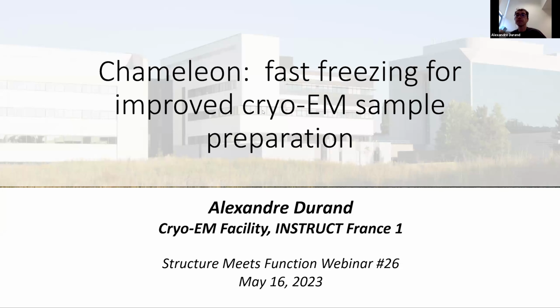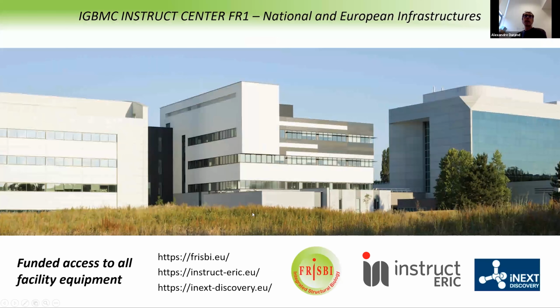Okay, so hello everybody. I will present to you the chameleon, which is available at the cryo-EM facility of Instruct Center France 1. The chameleon is a device to improve sample preparation for cryo-EM. Catherine quickly introduced the Instruct Center France 1. I will not go into the details of it, but all the equipment that I will speak about is accessible via Instruct or other programs. So if you ever want to run projects with us, you can contact me.